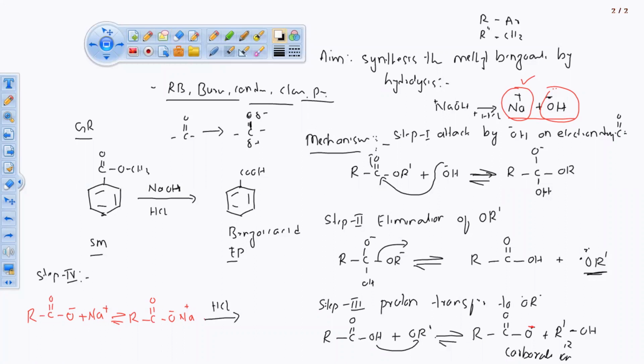This was the filtrate we had, this was the residue, which we discarded. So we have taken this one, already containing sodium, that sodium got added up with this, and then we got this product, the salt containing carboxylate ion, the sodium salt of carboxylate ion. We need to convert this sodium salt of carboxylate ion into the pure form of acid.